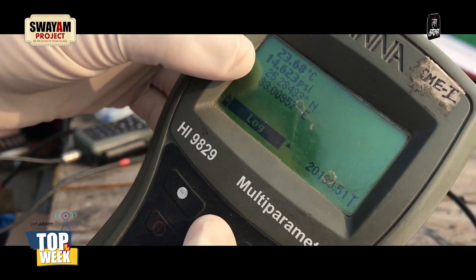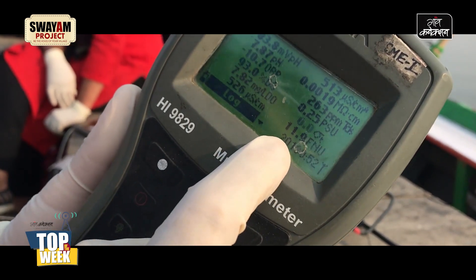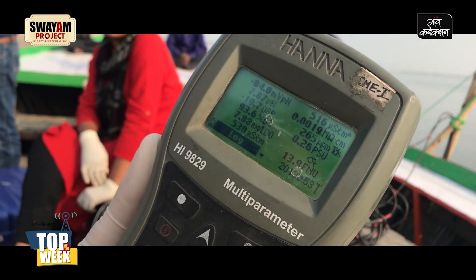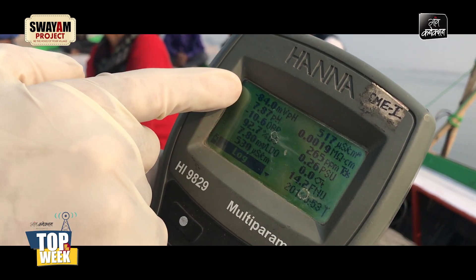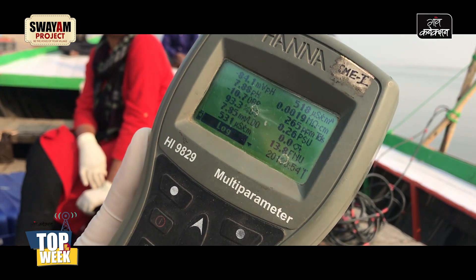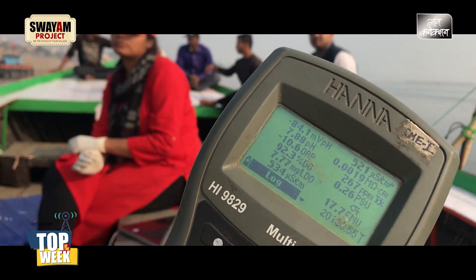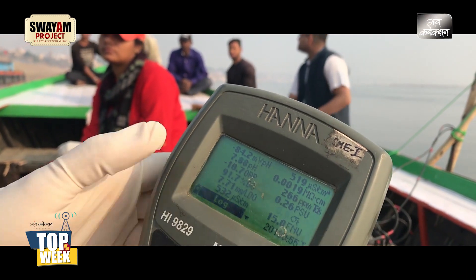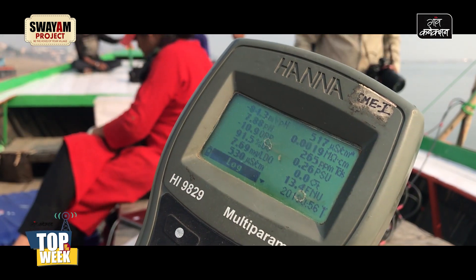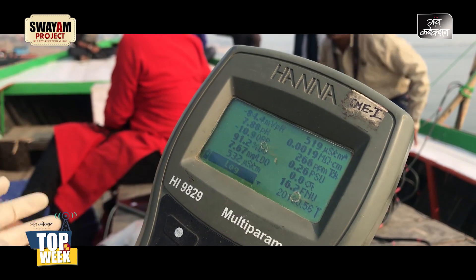We have the GPS positions — latitude, longitude — as well as temperature and pressure. On this screen, we see a bunch of different parameters being monitored. The bottom right corner gives you a count of the readings — right now we see 53, and after 10 seconds it will go to 54. The pH is about 7.88, dissolved oxygen is about 7.87 milligrams per litre (a sign of a healthy river — DO has to be greater than 5.5 for aquatic life to survive well), electrical conductivity is around 500 microsiemens per centimetre, and we see the turbidity values here. This shows that the river parameters are quite normal.